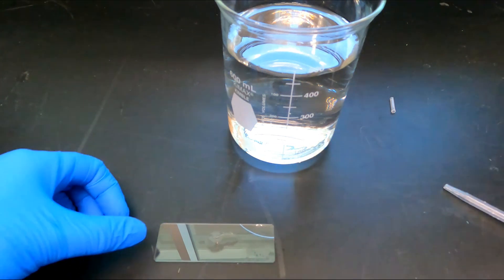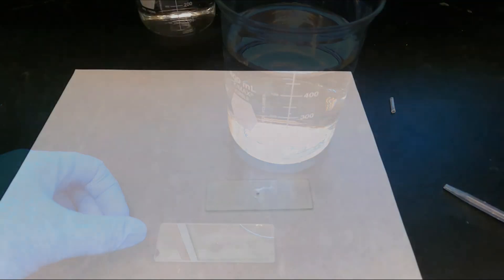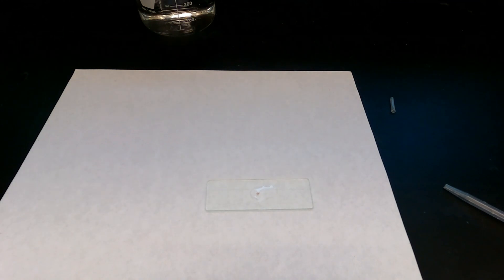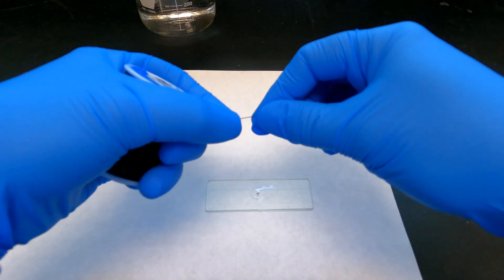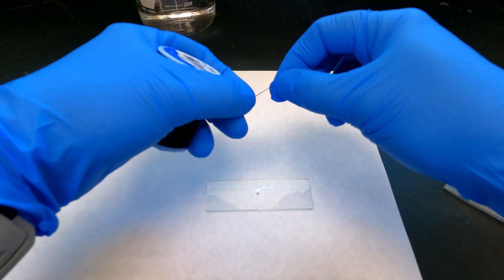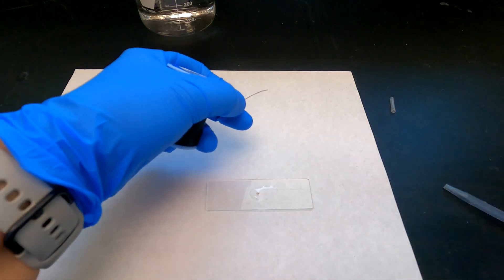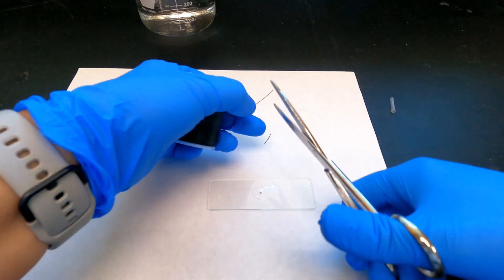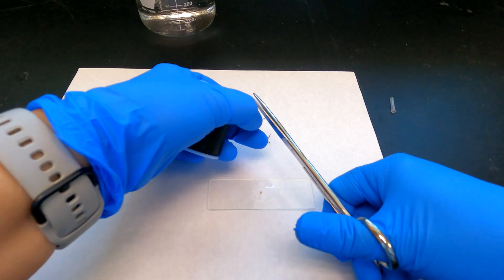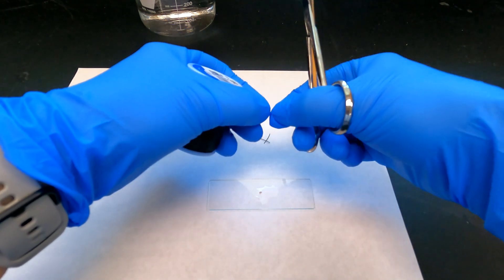If you find that your Daphnia is moving too much, making it difficult to see the heart or count the heartbeats under the microscope, you can use sewing thread to corral the Daphnia on the slide. To do this, cut three short segments of sewing thread, each no longer than one centimeter in length. Once you have the thread cut, arrange the pieces in a triangle around the Daphnia.